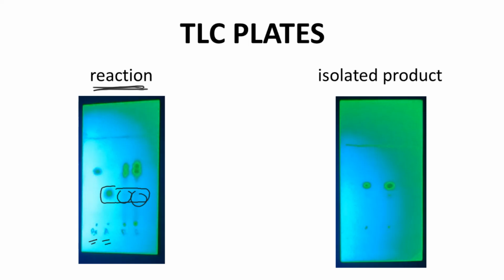Great, so the TLC on the right is the isolated reaction product. See that shadow? It's very faint under what is presumably the product spot. In my head, I said, aha, there is the small amount of residual aniline starting material. As I look at these plates side by side, I don't think those spots line up. I doubt they have the same RF.